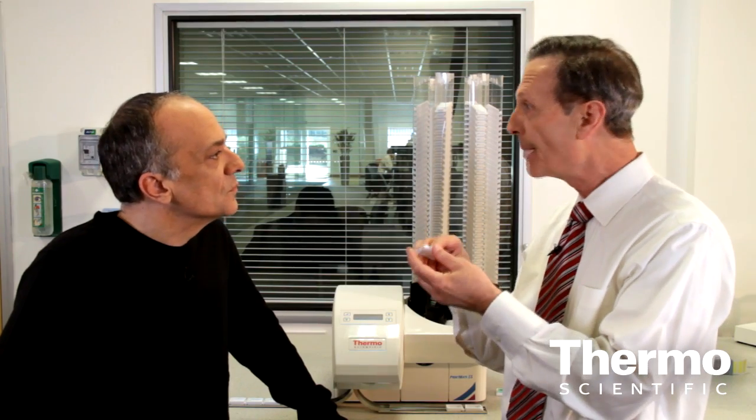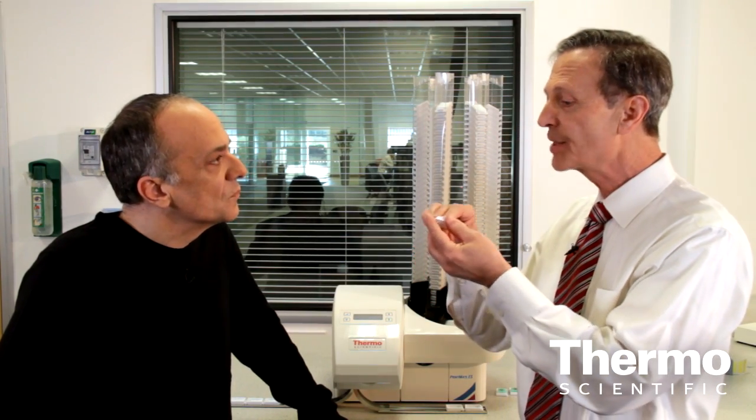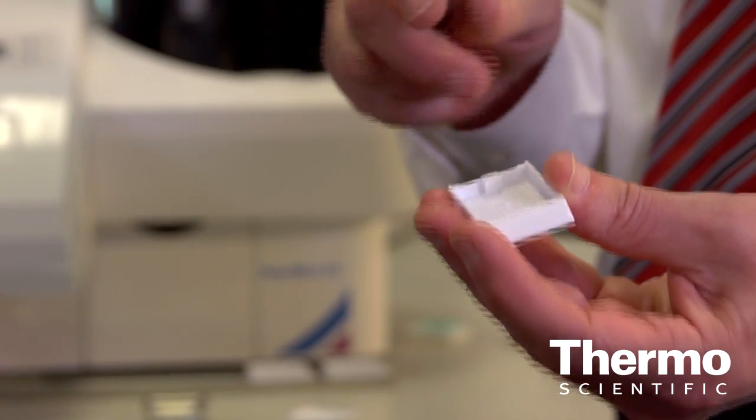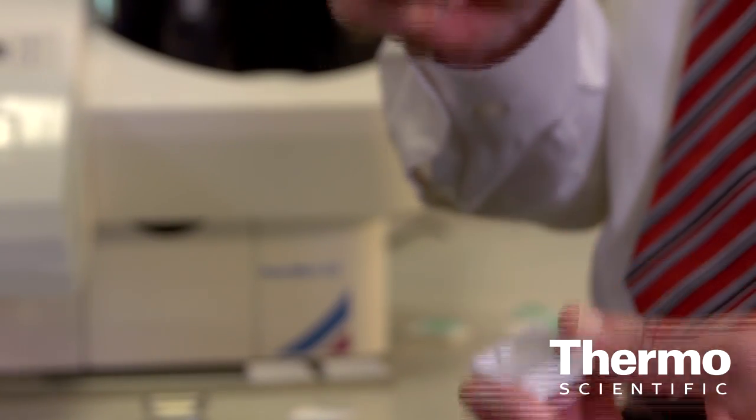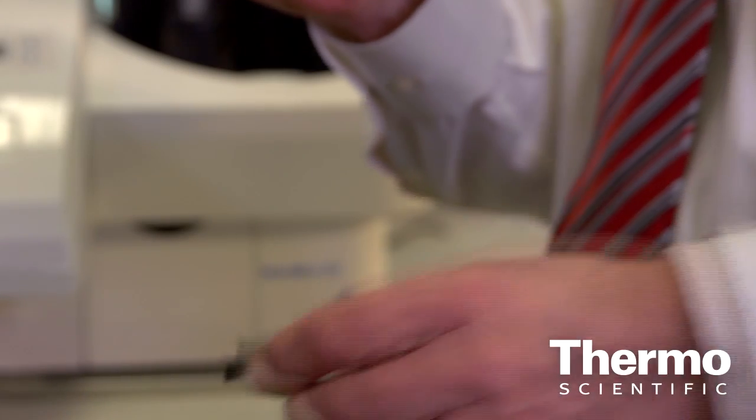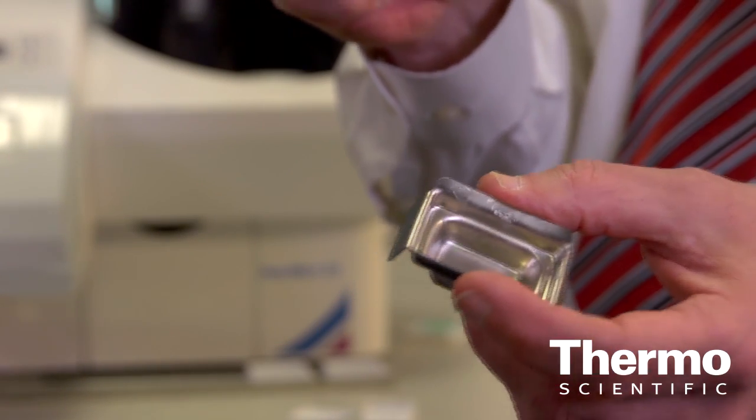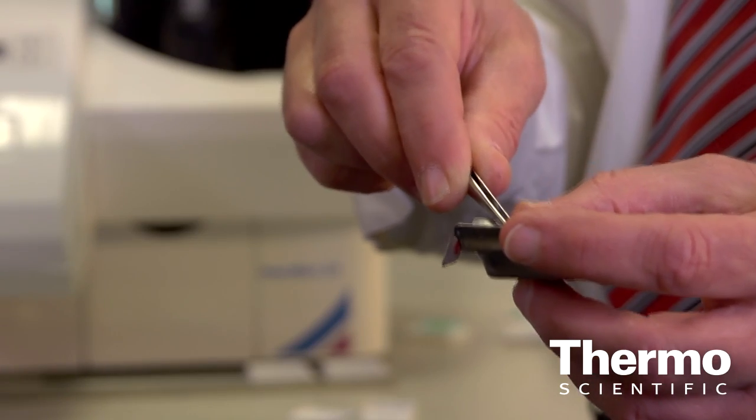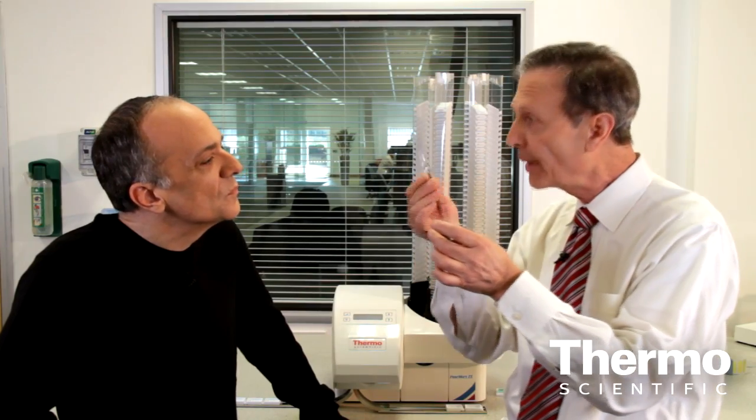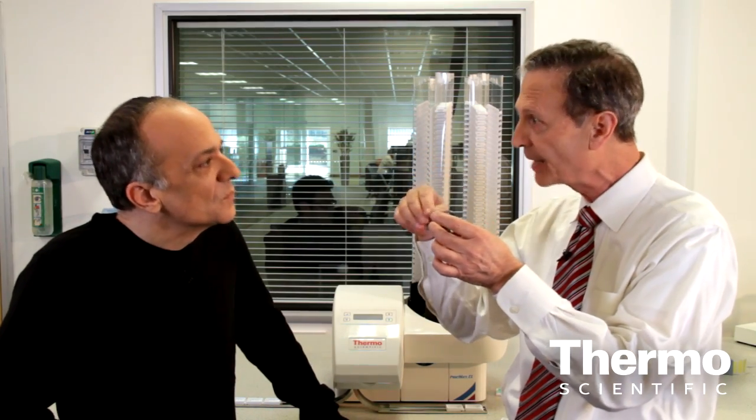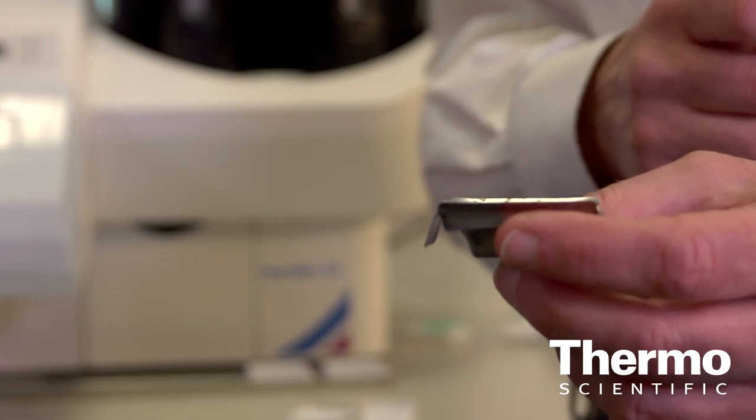The next step in the process is what's called embedding. A histotechnologist will open the cassette, take out the tissue and place it in a base mould where she has to hold it, place a small piece of wax in and then wait for the wax to solidify. The orientation is critical because the pathologist needs to see a particular slice through a particular geometry of the tissue.